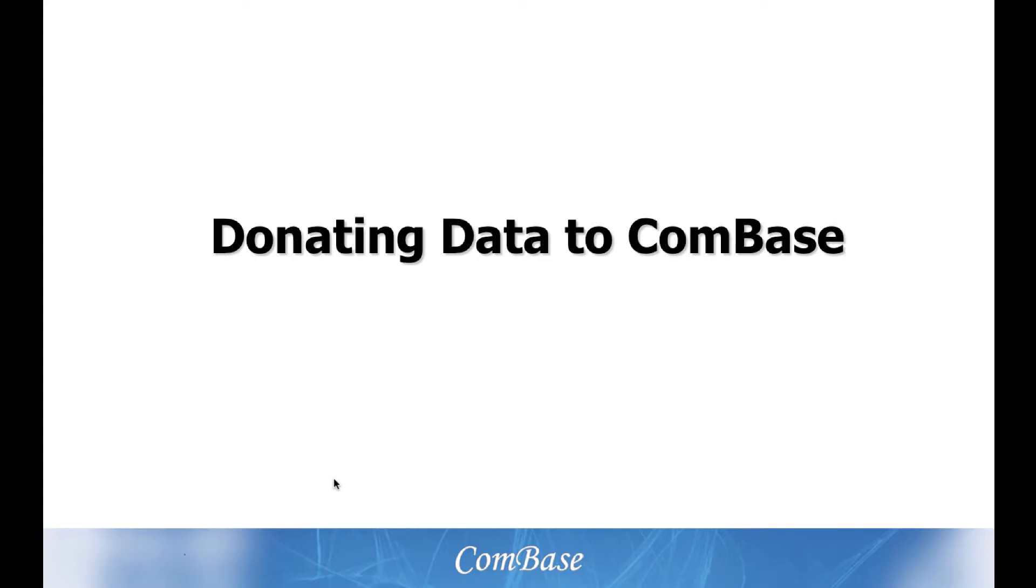Welcome to another ComBase tutorial. This video is about donating data to ComBase, especially about how to format your data.